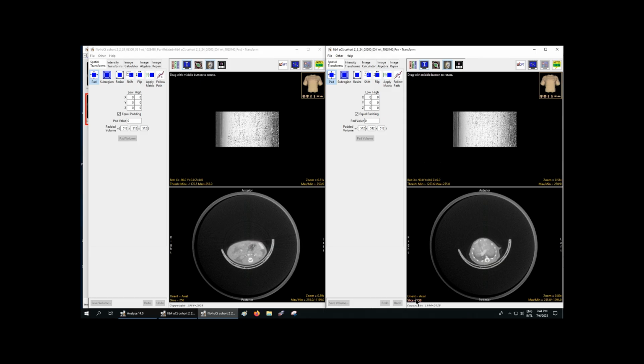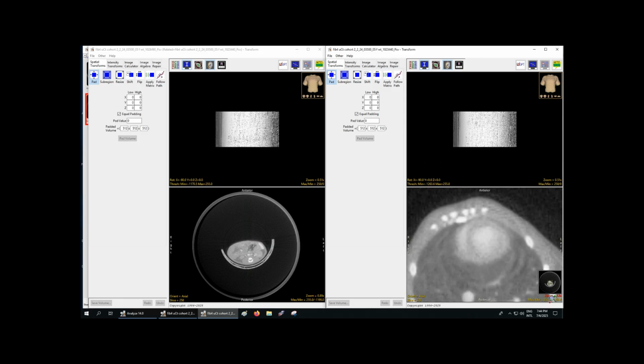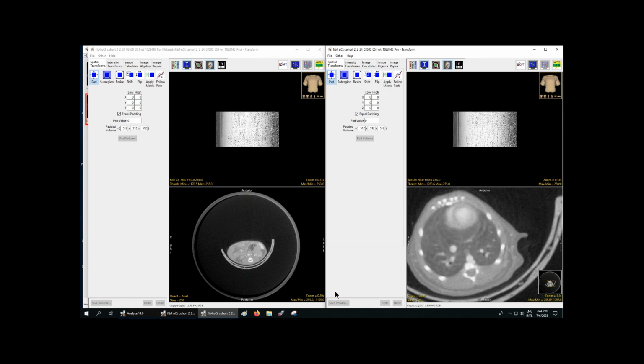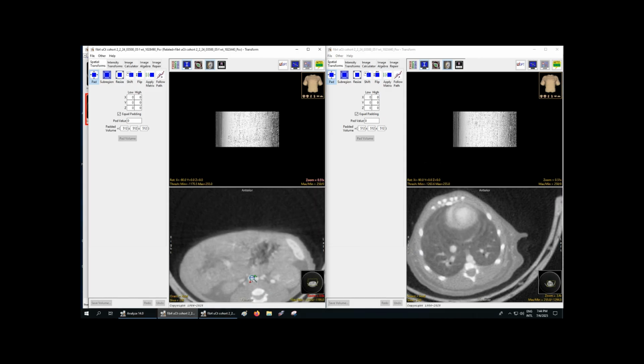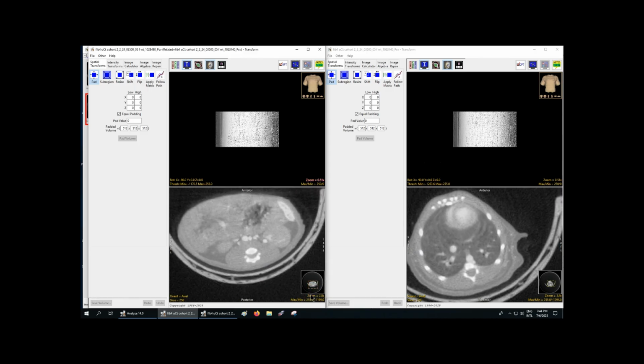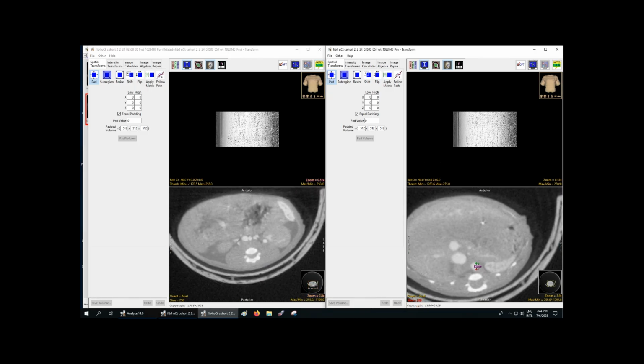The goal here is that we're going to find one overlapping slice or one common slice in between the two data files. Make sure that that's a border for each file, and then we're going to attach both of them together. The only difficult part is that we have to find the common slice and to make sure that that is also the exact same slice.